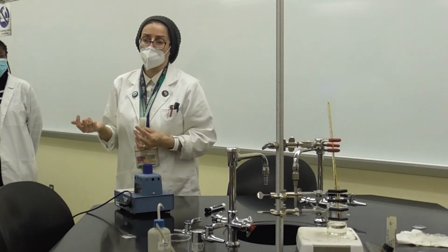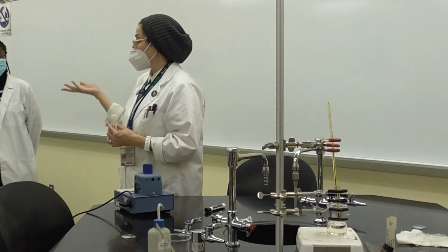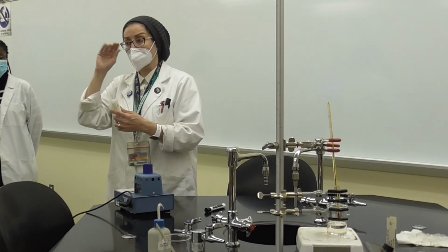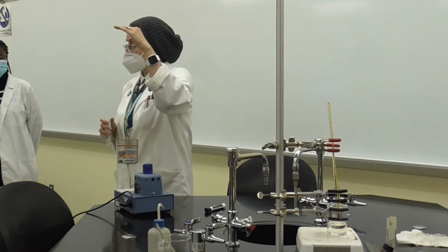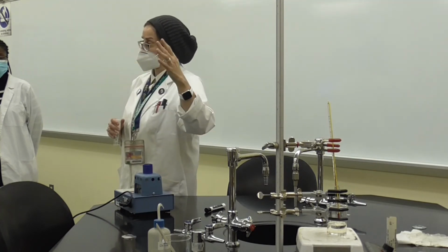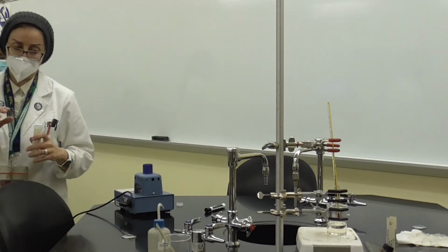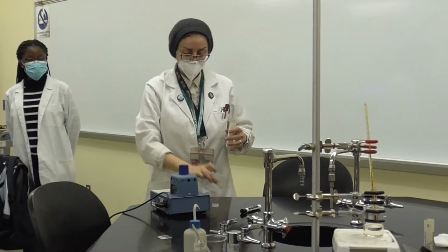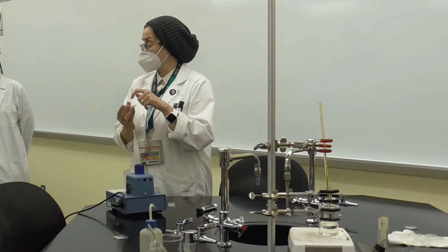How are we going to know that? Because we already studied the list of the chemicals that we are going to have. We know the expected melting points. So we will set it up on the highest melting point, and then we'll take it from there. Usually what we do in this case, I have this watch glass, all right? And I'm going to put some of the powder inside this watch glass.